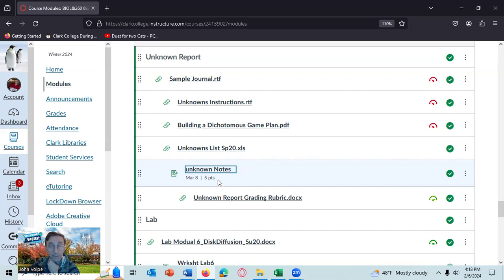Okay, because if you ask a test that is 2 days, you'll get the results after the report has to be turned in, and that will be too late. Most of the tests do take 2 days to incubate. Some take 5 days, one takes 7 days, and there are a few that you get the test in 1 day or less, but there's only a few that way.